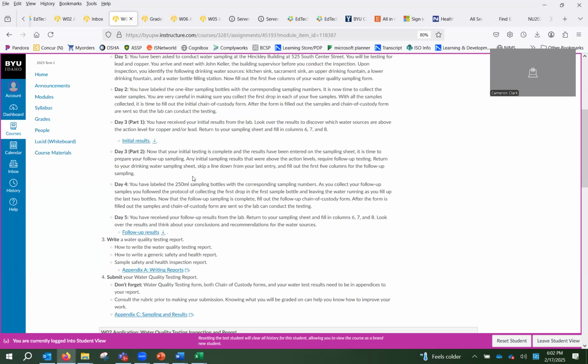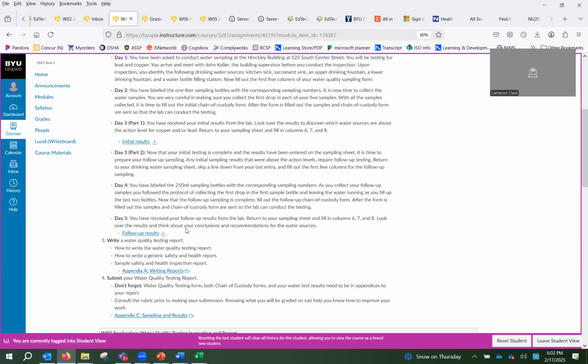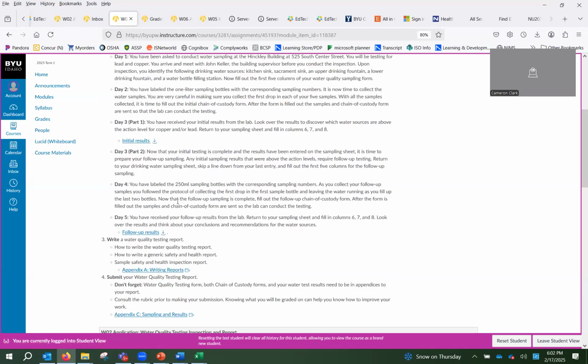Okay. So what you'll do on the follow-up is initially you found those results that you downloaded right here. Well, one of those was maybe out of line or a little bit high. So then you're going to do your follow-up results. And the follow-up results are going to go down in the lower part of that testing survey form that I just showed you. So what you'll do is you filled out the chain of custody form.